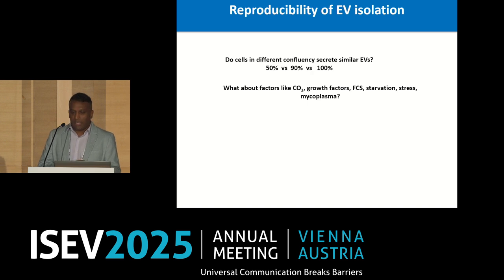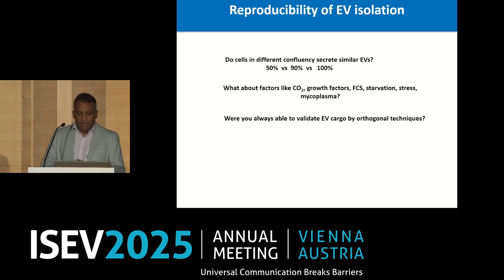So you need to understand that and be mindful about that when you're doing any omics analysis. You also need to validate the identified cargo, those which you are importantly studying further. For example, if you're identifying 3,000 odd proteins from your EV prep, and then you're associating a particular functional state, let's say an EV is curing cancer, in that case, you may need to understand that these proteins need to be validated, or this RNA needs to be validated by orthogonal methods. You do not do this for all the proteins or all the RNA, but those which are important.